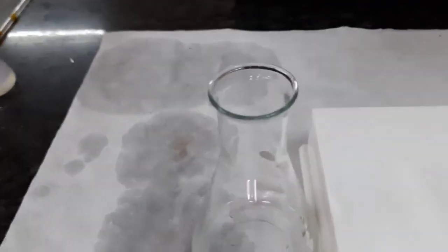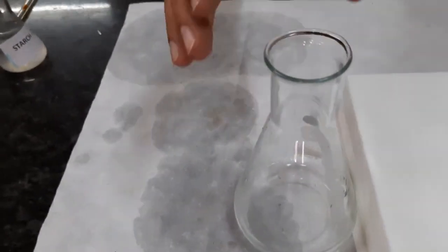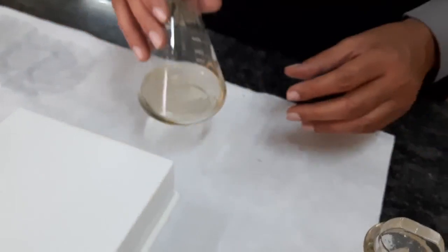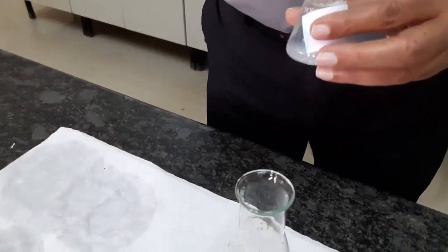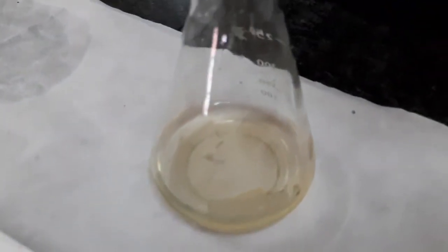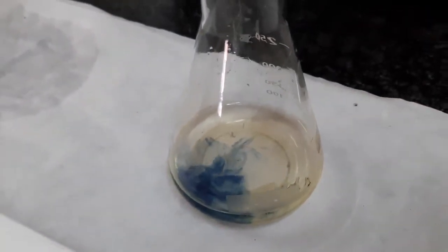So for the next titration, 50 ml of the sample is taken for the second reading, and to that you will be adding 1 ml of starch. As I told you, you don't have any problem in pipetting starch, you can take it.